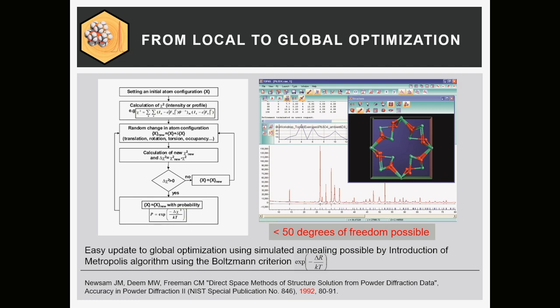Forget about parameters being so close to the truth. Just say, hey, put all the parameters in. We have this global parameter space. This is 20 parameters, so a 20-dimensional space. Is it done in a minute? It's not done in a minute, because if you do it nowadays, it would take a couple of million years with our computers. It's an easy calculation. I could do the calculation here. I could show you. It takes a few million years to solve a moderately complex problem, actually a simple problem.